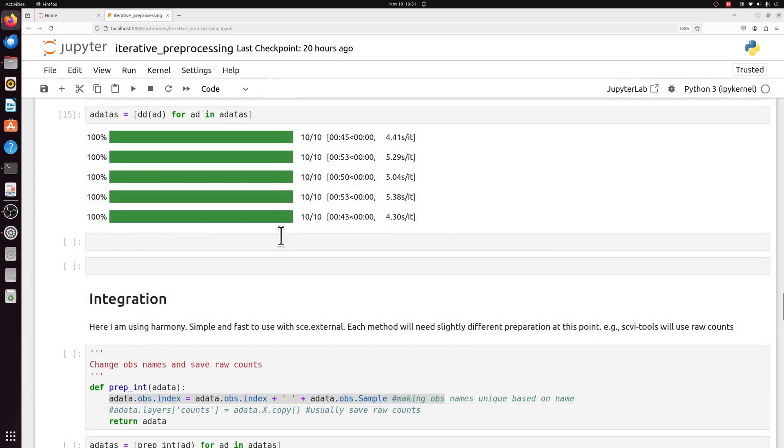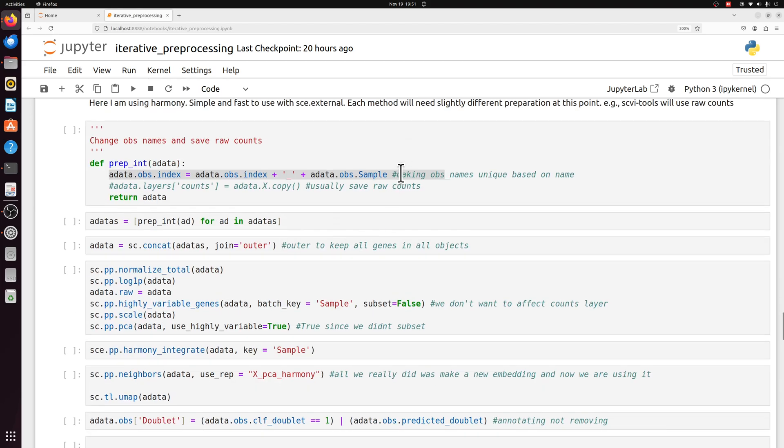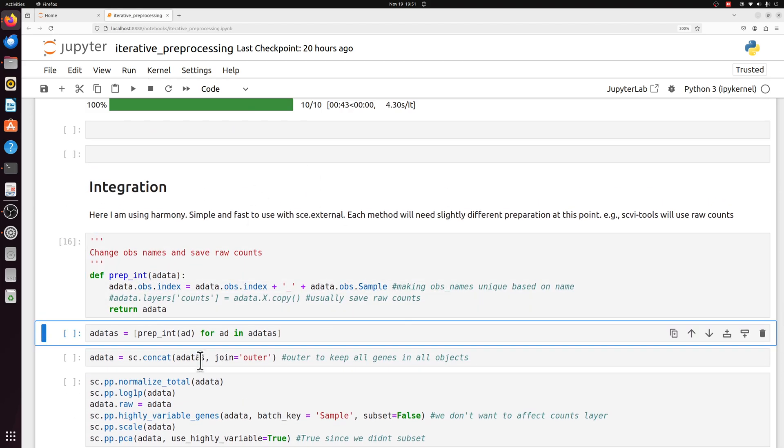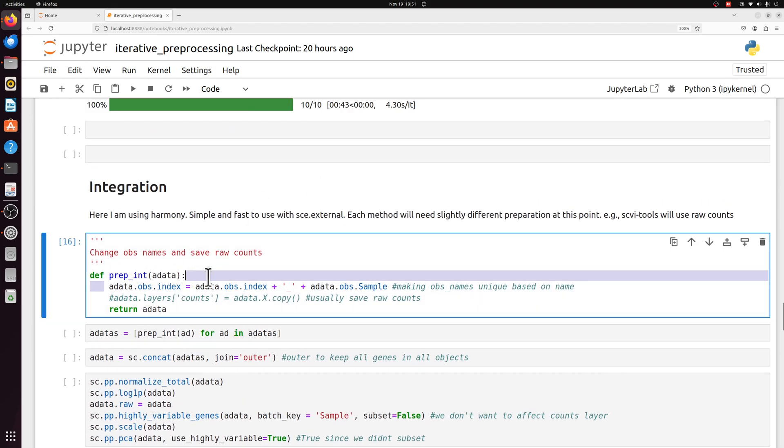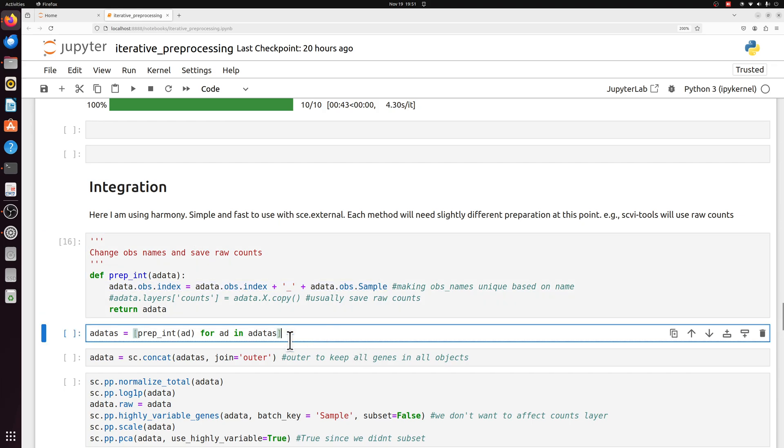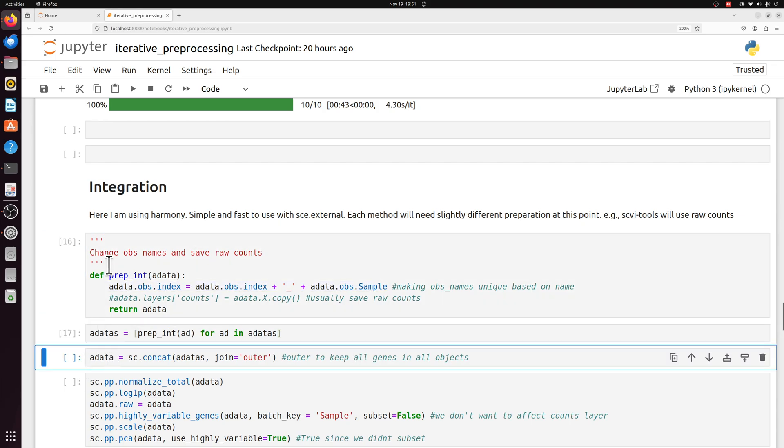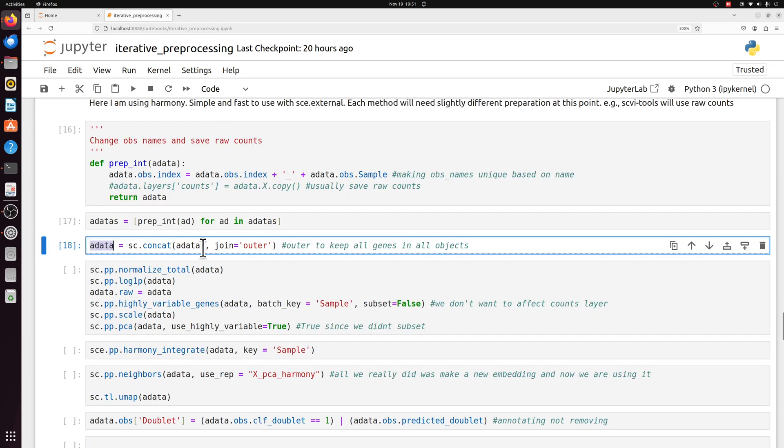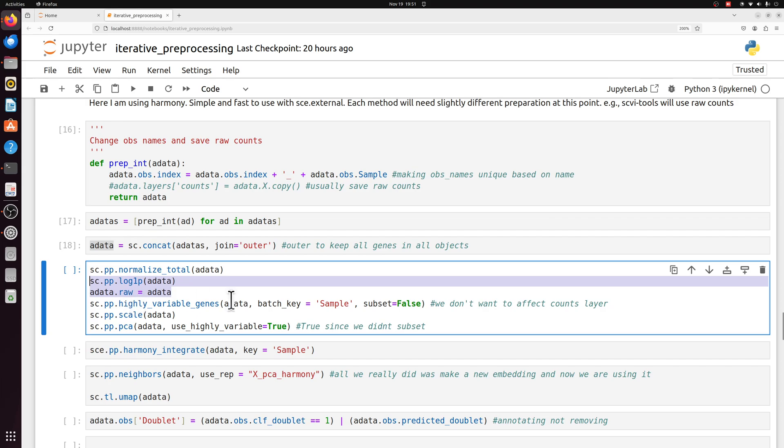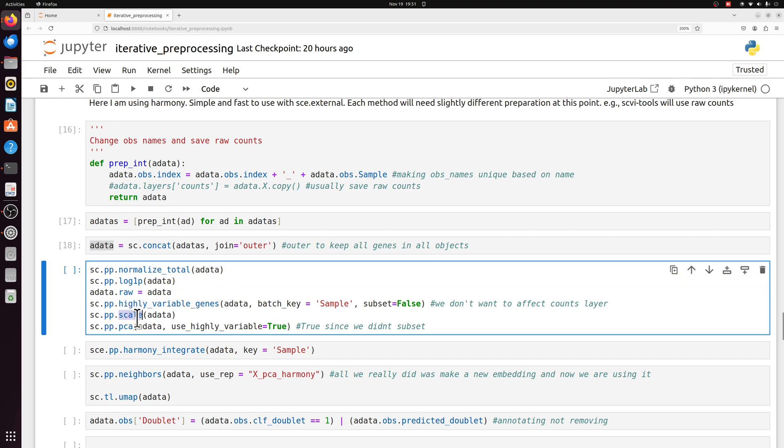Now that we have the doublet annotated but not removed, we're actually going to integrate data. In this case, I'm just adding the sample name to the barcodes just so we can differentiate them. I'm combining the data into one adata object. And then we're just doing typical normalization, transformation. We're saving the raw data because we'll need to use that later, getting the highly variable genes, scaling, and getting the PCA.